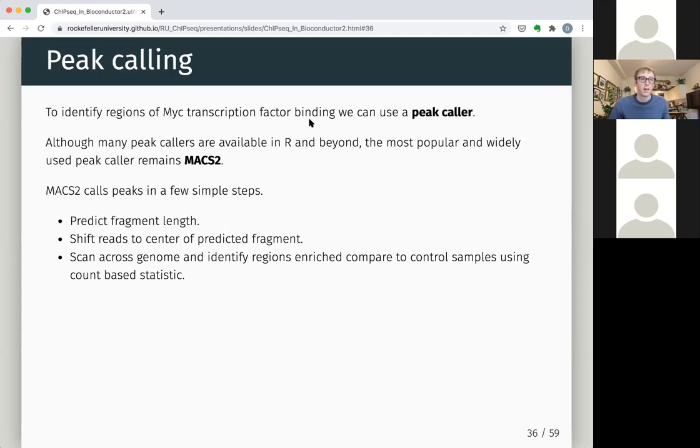And so oftentimes it's an assessment of just actually calling peaks with your peak caller and then looking in IGV and seeing if it looks like it's actually catching the things that look like peaks by eye. And so it can be a little bit of optimization, and you'll get a handle for which peak callers you like for certain ChIPs. But generally MACS2 does pretty well out of the box. And so that's usually where we start and where people usually start.